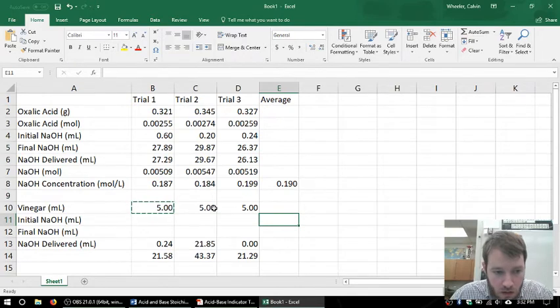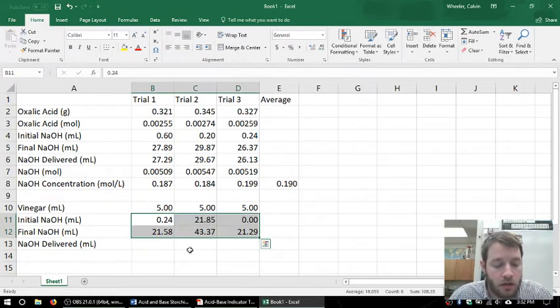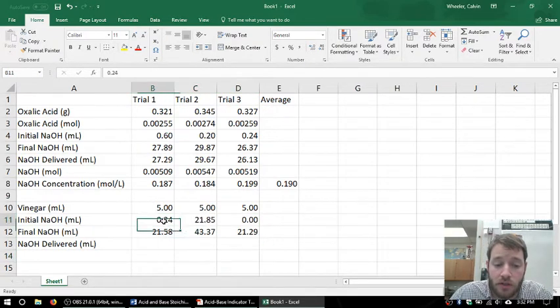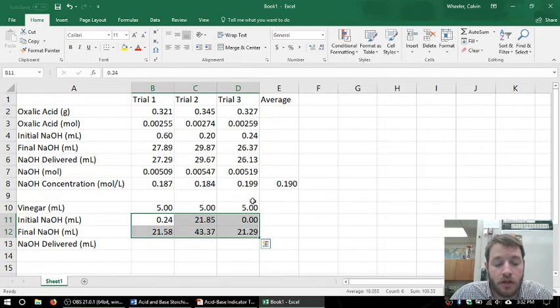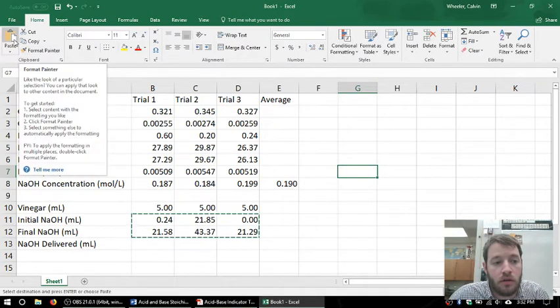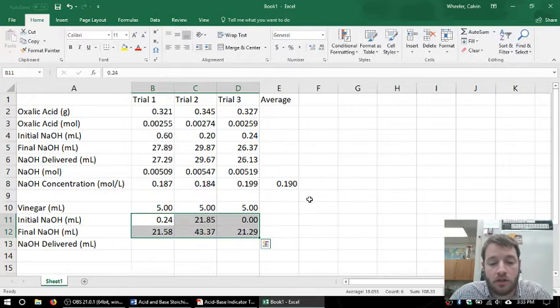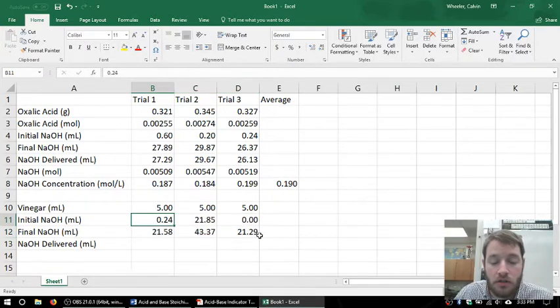Perfect. For my data, I already pulled that earlier. Move it up. I cut and pasted. So you can cut and paste stuff wherever you want just by selecting. And then I do Control X, but you could also use the button up here. Click and then Control V, or use the button here. Paste, and it's going to move it around. So I can quickly select and move data. So there is my vinegar titration data that I pulled from an older student's lab.